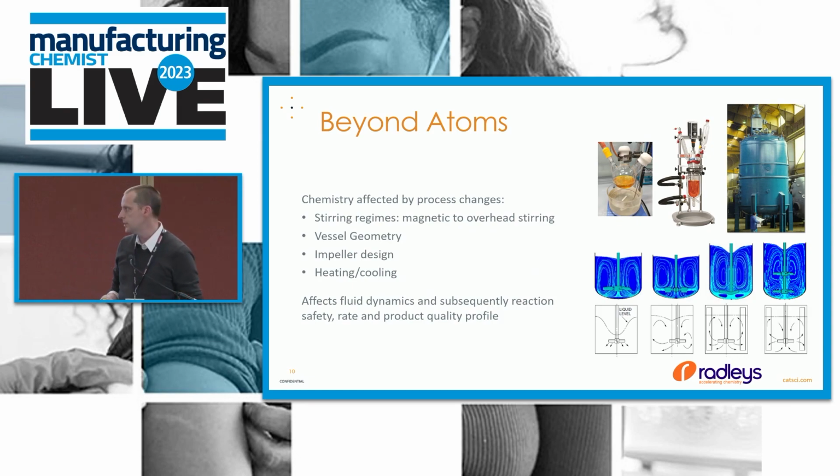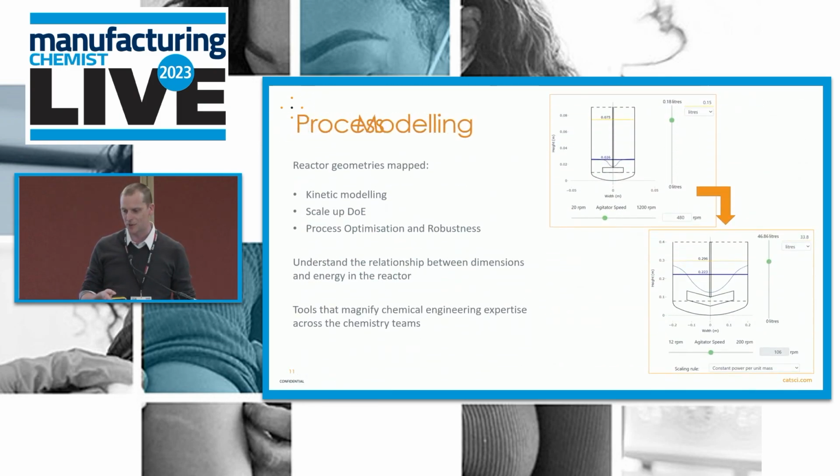And you can see some images here, thanks to Radley's, some fluid dynamic images of the type of stirring patterns that happen with different impellers. But all of those changes affect that mixing, affect that reaction, and that has an impact on safety, on production rate, and ultimately on product quality. So again, just like Nick, we should have maybe discussed our presentations beforehand.